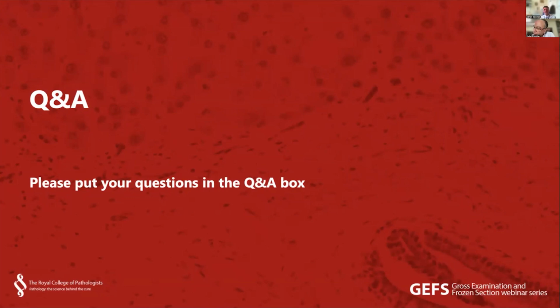Yeah. Okay. Another question is, should the mesenteric margin always be represented with a colonic wall?